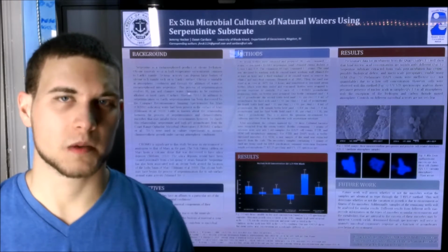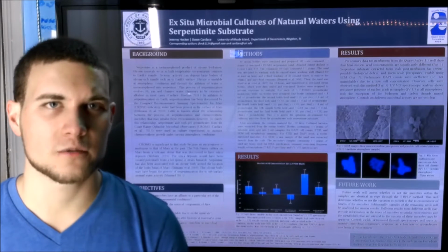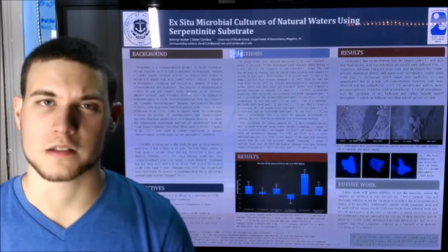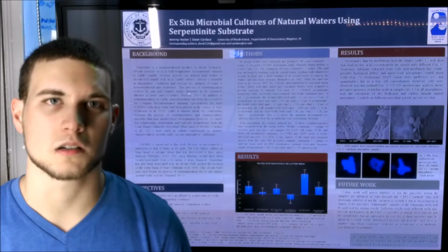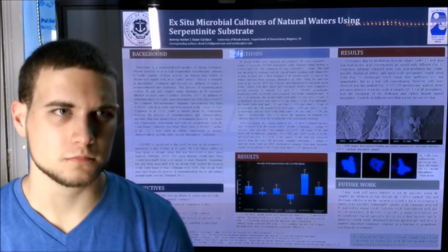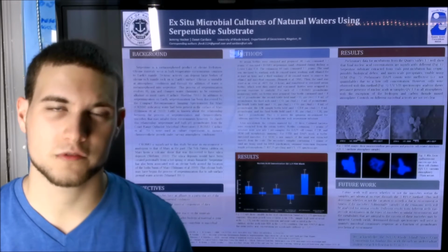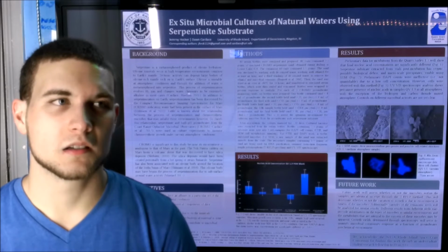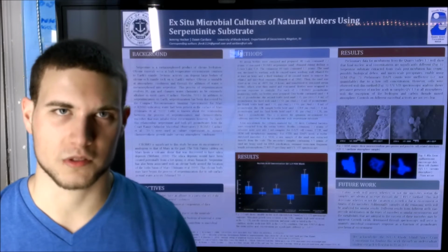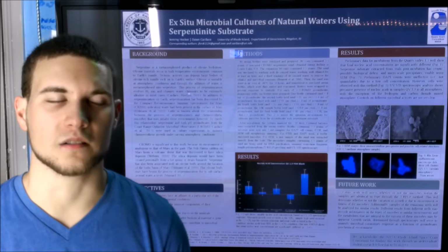Now that microbial growth has been determined in our samples through the use of UV-vis spectroscopy, further research will assess whether or not those microbes that exist in those different environments are the same or not, or whether the growth yields are due to the fitness of one particular microbe. Terminal restriction fragment length polymorphism is a technique used to cut DNA at particular base pairs into different lengths, creating a rudimentary fingerprint of the DNA of the microbes.